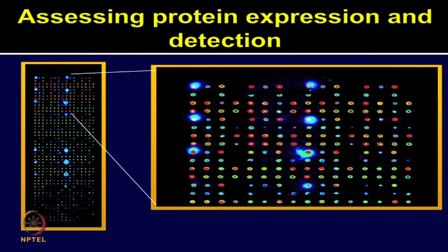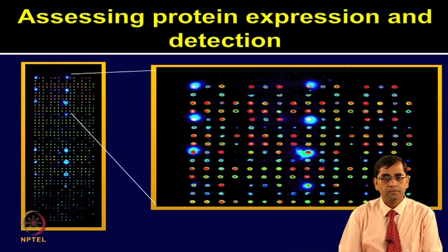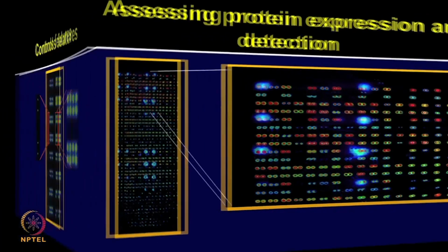If you are looking for different types of immunological response in biomarker discovery etc., you need to ensure that immunoglobulin IgG is printed at varying concentration. It can also be used for statistical analysis that is run by the biostatistician, so that different types of protein expression can be normalized.